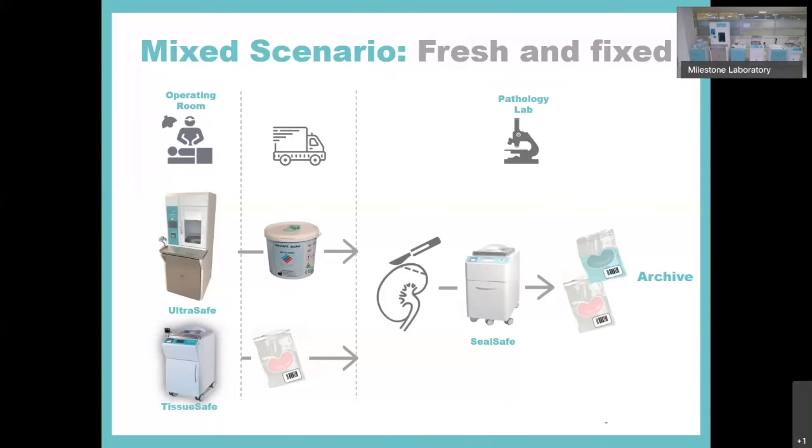Only the ones necessary for the pathological examination were transferred to the pathology department, even after 2 or 3 days. The rest remained in vacuum bags and were disposed of directly from the labor and delivery department. So in this scenario, nothing prevents you from still using a vacuum system in the pathology department to vacuum seal the biospecimen and take advantage of the reduced archive space.